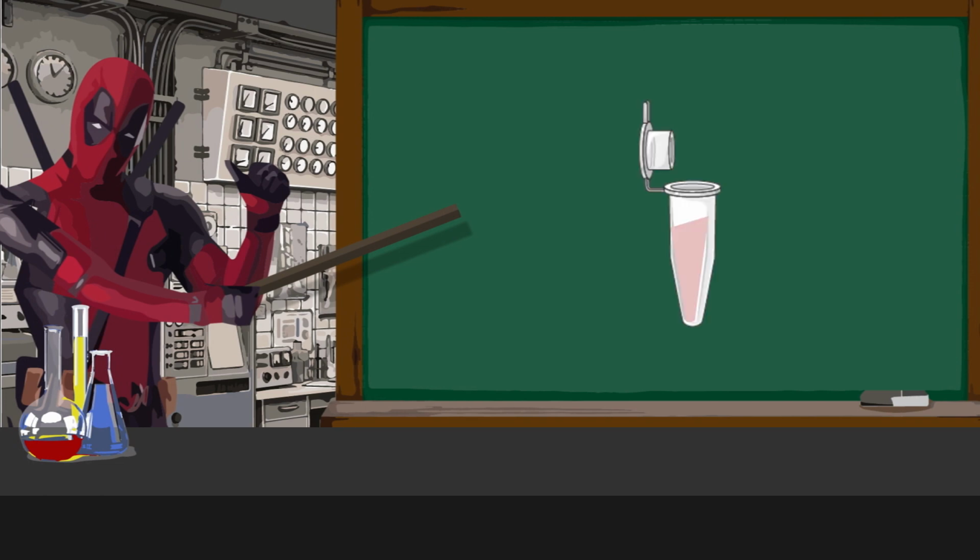Lastly, you return to the main culture, and then you add 25 microliters of IPTG to it. Once you do so, you can return it to the shaking incubator for 4 hours. And that's the end of that step.